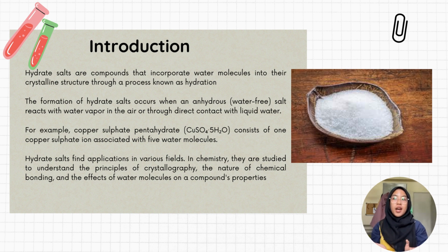The formation of hydrate salt occurs when an anhydrous or water-free salt reacts with water vapor in the air or through direct contact with liquid water. This results in the salt molecule incorporating water molecules into their crystal lattice. The number of water molecules associated with each salt molecule is often expressed as a ratio in the chemical formula of the hydrate.